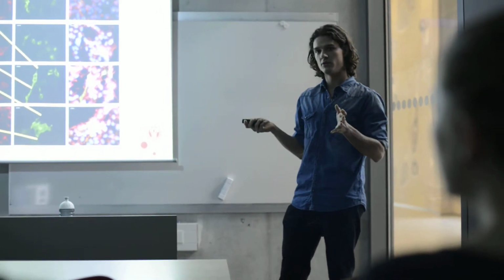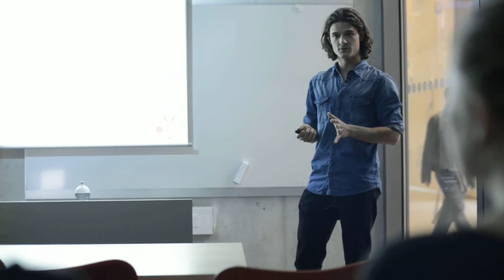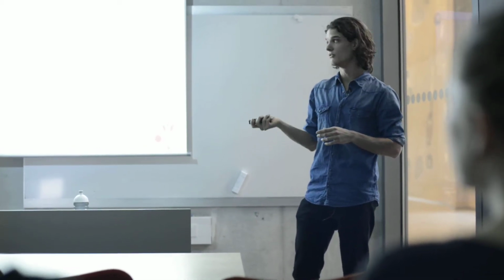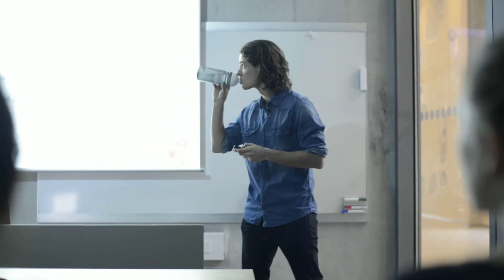After this, we decided to run some purification of the samples and send them to mass spectrometry. I'm not going to show you the results, but I can tell you that the purification of the GFP constructs was successful, and we decided to send 3 samples for mass spectrometry analysis, namely the GFP control, the N-terminal NBC1, and then full-length NBC1. Unfortunately, analysis of the constructs has yet to be carried out, but I hypothesize that due to proper expression and purification, MS analysis should return binding partner candidates. This is the conclusion for the first part.